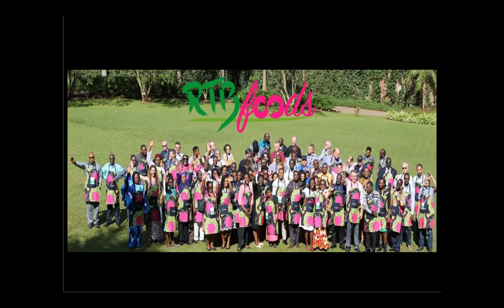If it is 1 minute to acquire the image, how many samples can you evaluate per day? In my case, I use just 2 pieces of fresh yam, and I have sample holders of dimension 40 centimeters by 20 centimeters.